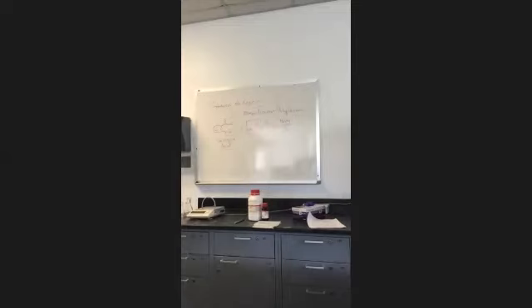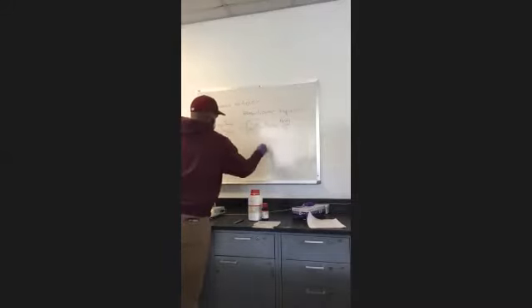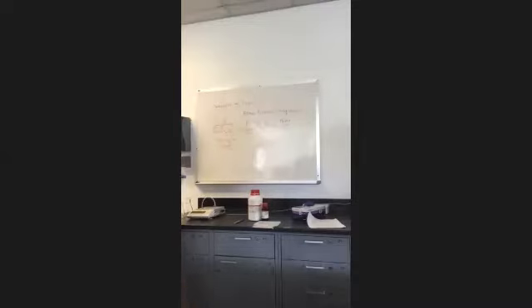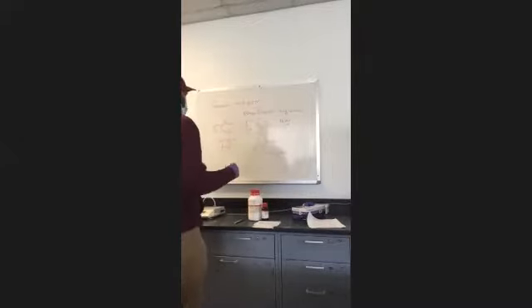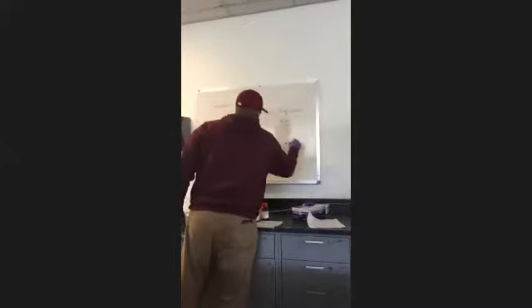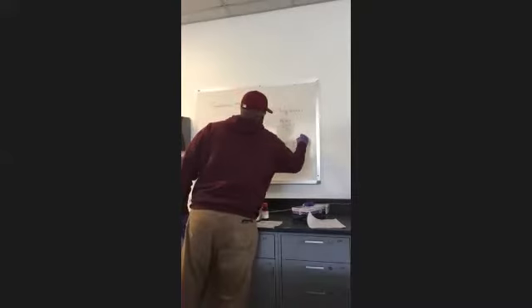Yes. All right. So we're gonna cap off this hydroxyl group with an acyl group, right? So the product, you can look this up, because I'm gonna need you to look up the molecular weight for aspirin or acetyl salicylic acid. I'm gonna write the name down for you, so don't panic about that. So it's OCH3, and then what we're gonna end up with is plus acetic acid.